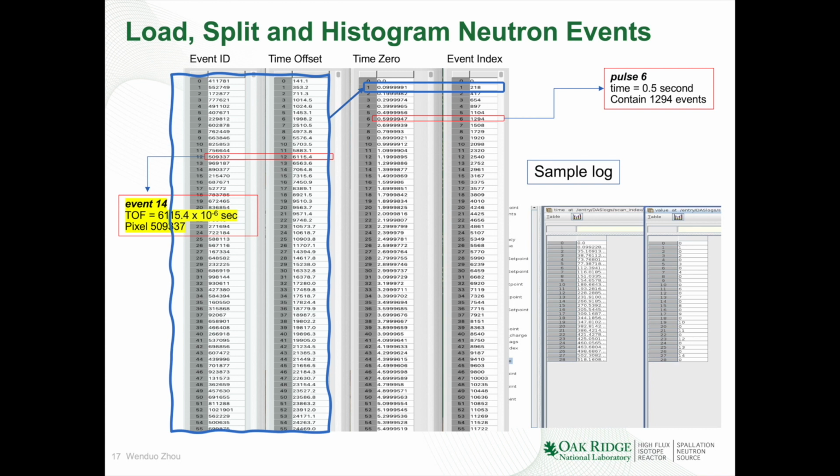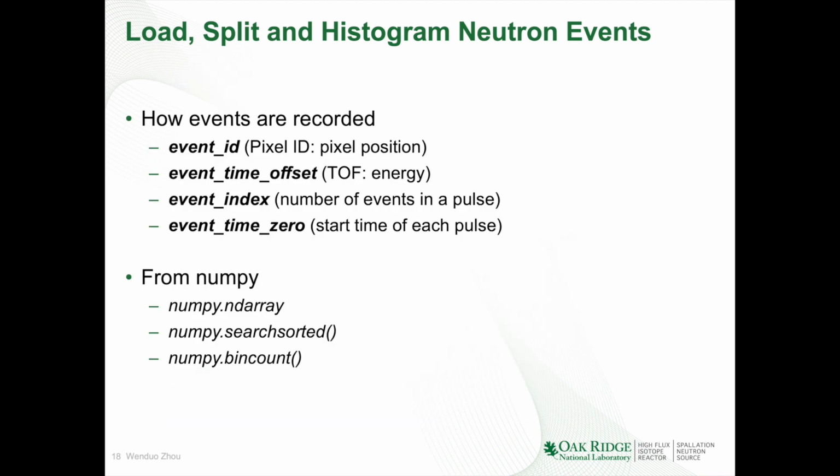One array is for the relative time to the run start when the metadata is changed, and the second array is the value that the metadata is changed to. By understanding this data structure with help of H5Py, all those 4 arrays are loaded to numpy arrays.